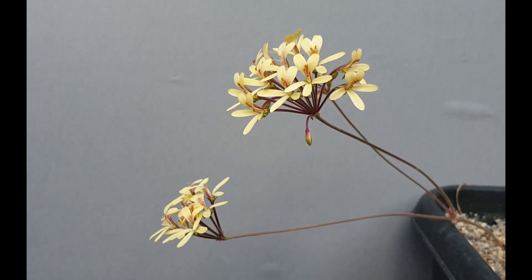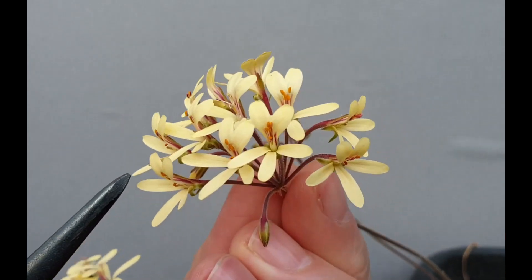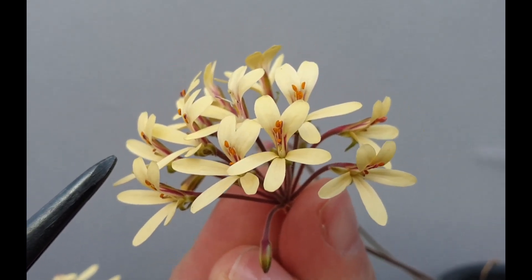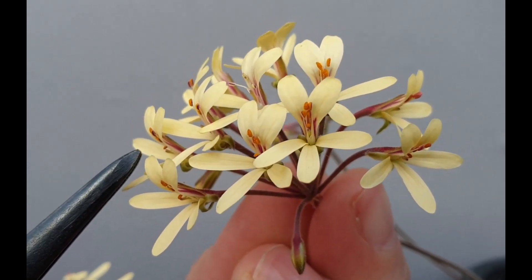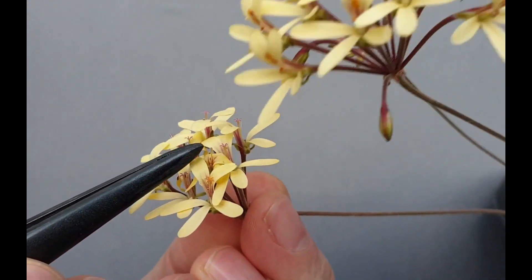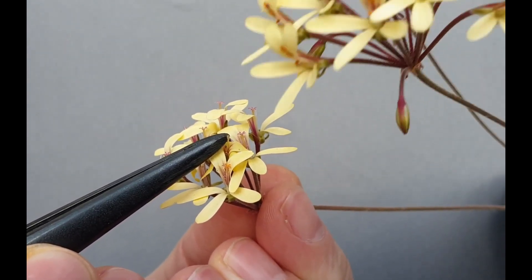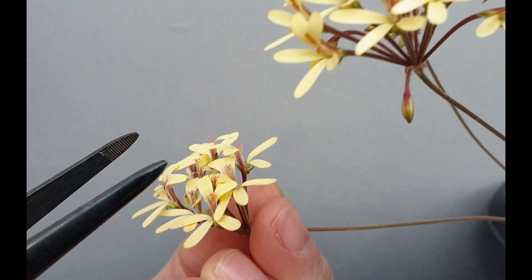What we need is the following. We need flowers with ripe anthers — we notice that the anthers are ripe because the powdery substance at the end of the anthers is the ripe pollen. We also need a set of flowers with ripe stigmas. These stigmas are ripe because the anthers have dropped off and the stigmas have opened up and are receptive.